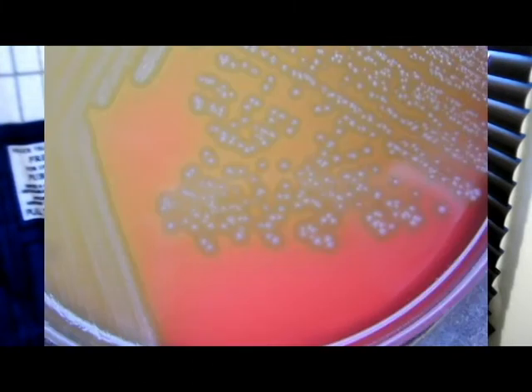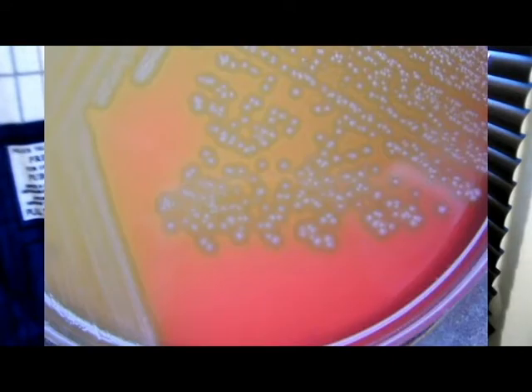If a colony is alpha hemolytic, it'll produce green halos. You'll see green halos around the colonies. Let me open this. Green halos around the colonies inside the plate once you've T-streaked it. Of course, your zone 1, you'll see nothing. Zone 2 will be harder to see, but once you get to zone 3 and your T-streak, you'll see little green halos around the colonies, and that's the alpha hemolytic.